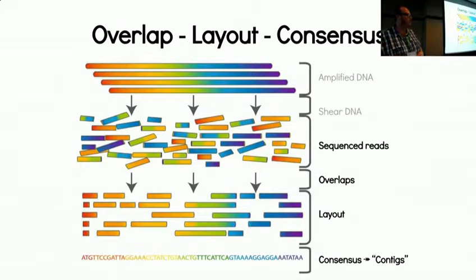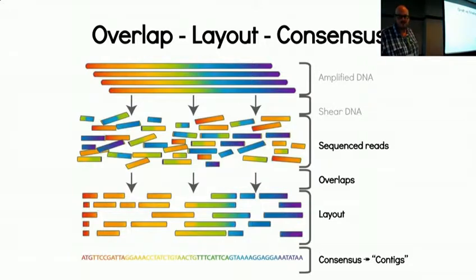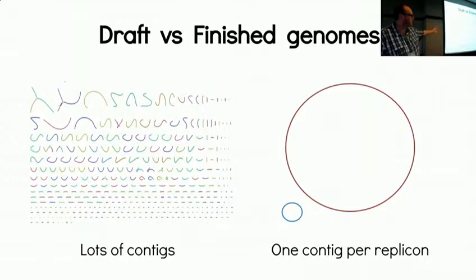And what are we actually annotating? Well, we're annotating a genome, but do we have an actual finished genome? No, we usually have contigs that resulted from the sequencing process and the assembly process. We end up with a bunch of contiguous sequences called contigs, and together they represent most of the original genome that we sequenced. Typically you're going to get a file with lots of contigs. If you're lucky, you'll get something like the one on the right. Today we're going to use something in between, a 6-contig segment of a bacterial genome. But like I said, if you've got your own genome or you want to download one, feel free to use that instead.